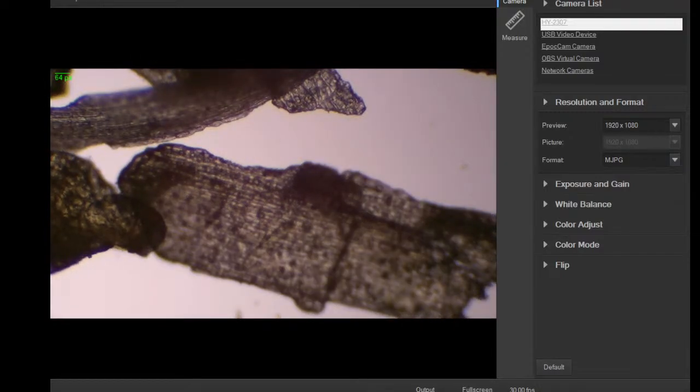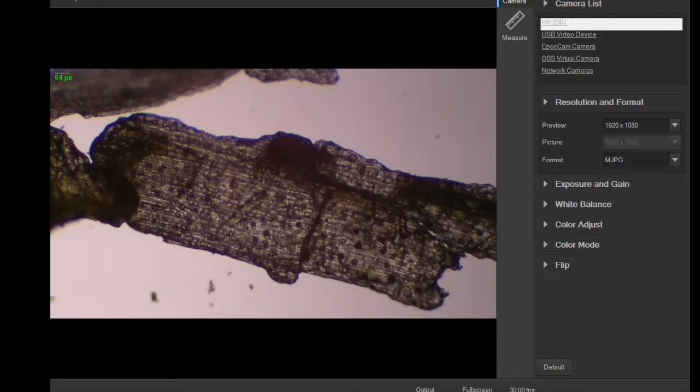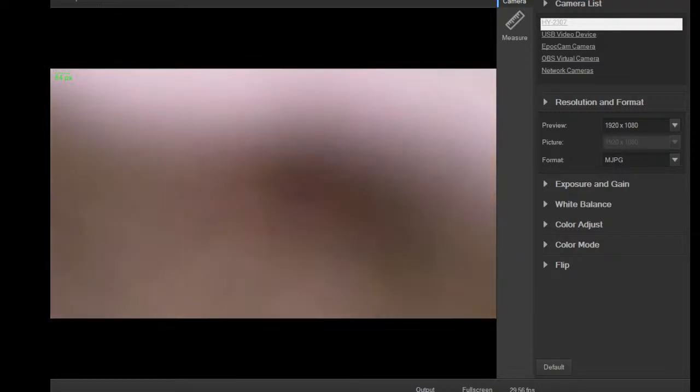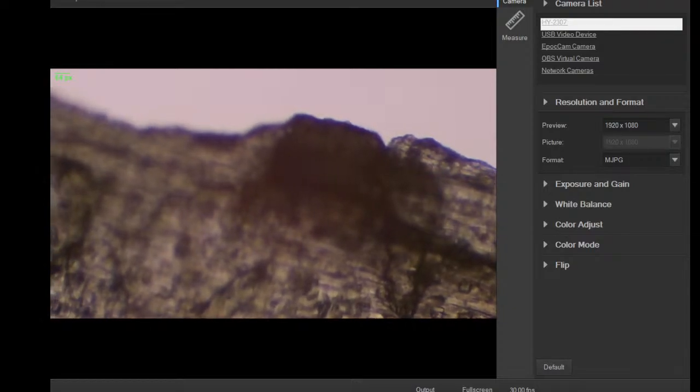And you can see, because it's garlic, see the little structure there? It's actually dried chunks of garlic, so you can see the cell structure there. I'm going to zoom in a tad. So if you remember the garlic skin I pulled out earlier, if you saw that part of the stream, see how that looks familiar? That was just the thin garlic skin on the outside of the peeled garlic, the white papery stuff. This is an actual pretty small garlic granule, dried garlic. And it looks identical to that garlic skin that I looked at earlier. You see the overall cell structure like a brick wall formation, and then you see these little variant pieces throughout, which those might actually be.